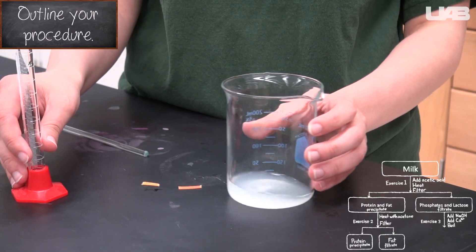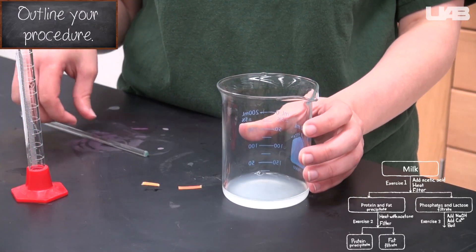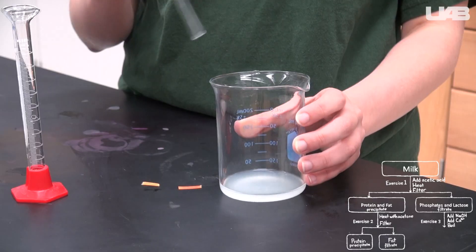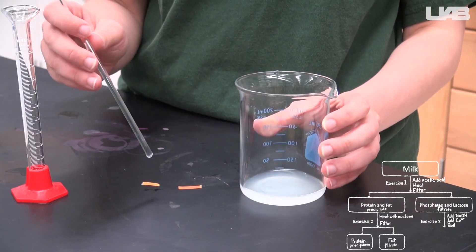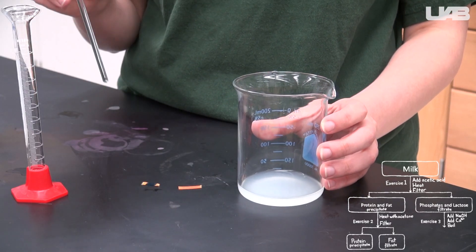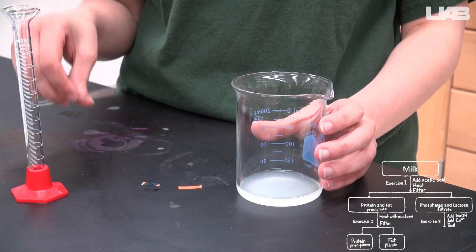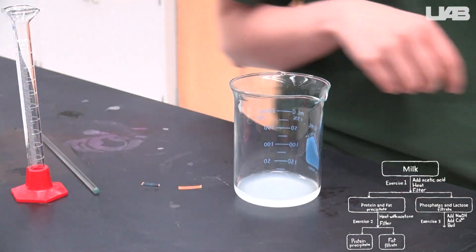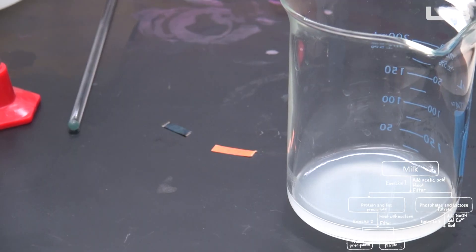Test the pH again to ensure that it has become basic and turns the litmus paper blue. You may have to add more sodium hydroxide if it is still acidic. Add a 1 milliliter portion of sodium hydroxide and retest. Keep doing this until you get blue litmus paper.